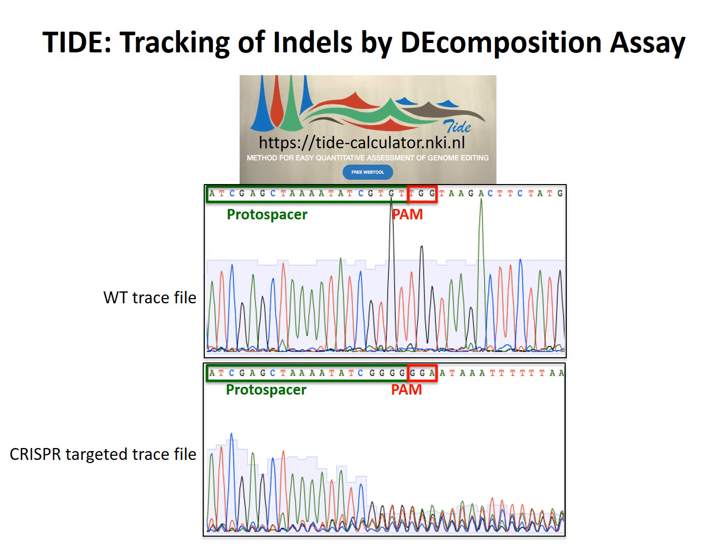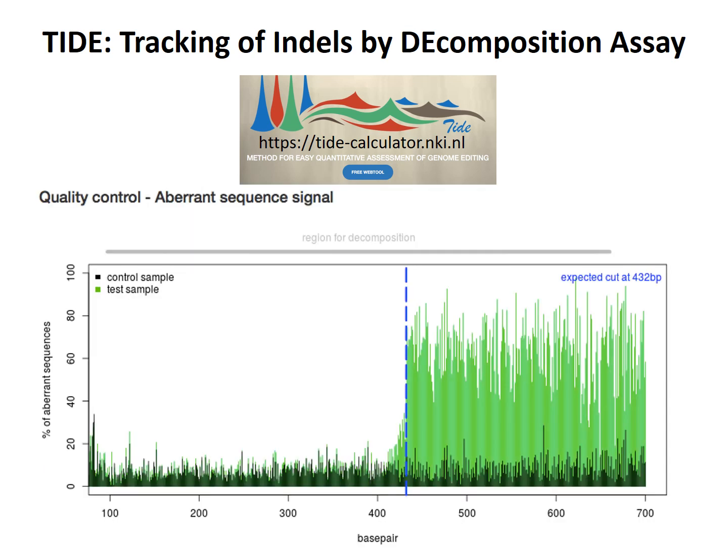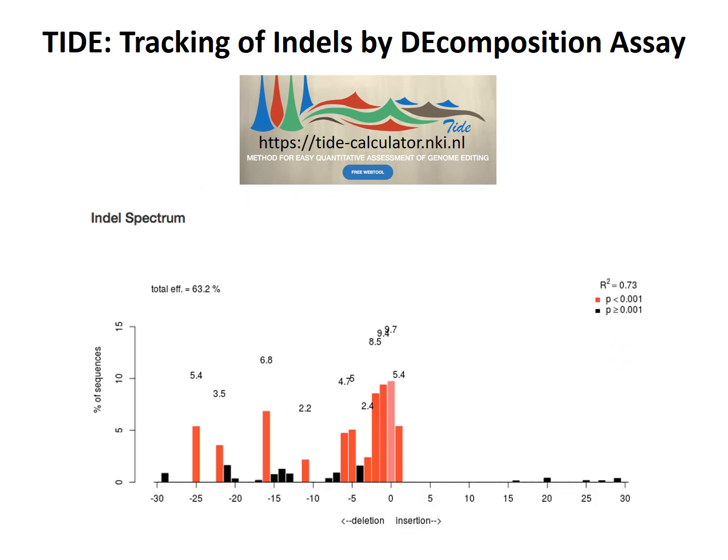Kind of analysis, when we set up the decomposition windows. Yeah, so what he means is, if you have a 300 base pair fragment and you send it for Sanger sequencing with a forward primer, sometimes it'll come back with 800 base pairs of sequence. That's because the algorithms they use to analyze your data are not sophisticated enough, especially when it goes into a bunch of messy peaks. So what he's saying is just set that to the true 300 base pairs, starting at the beginning to the 300 base pairs. Otherwise, TIDE has problems figuring out the indels.